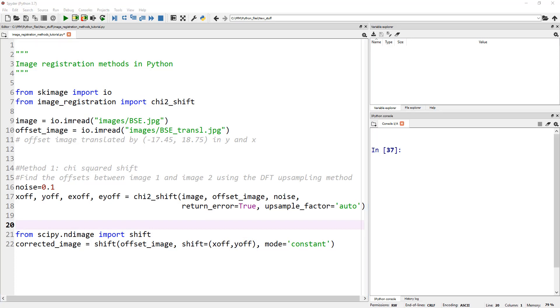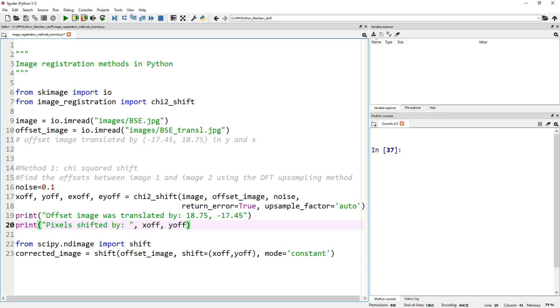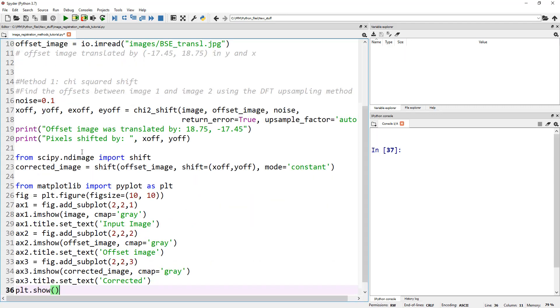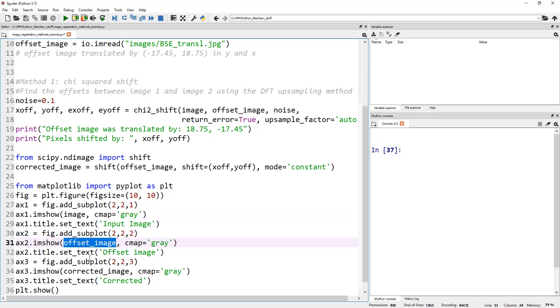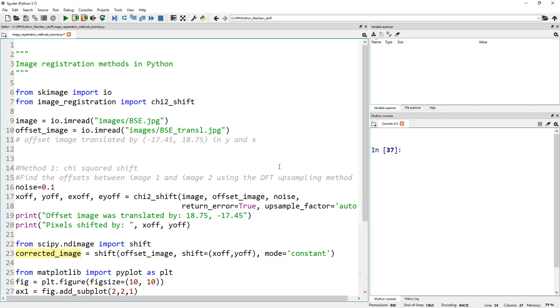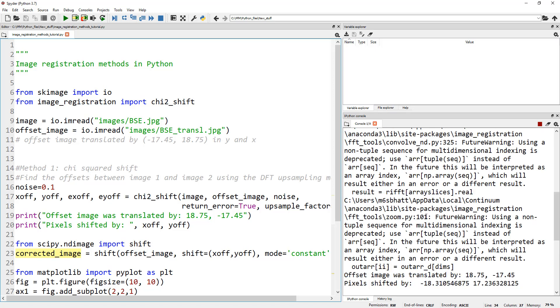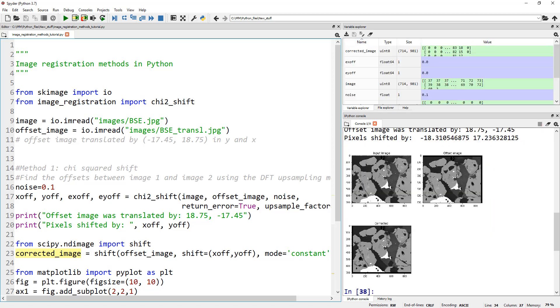For that, we're going to use a function called shift out of scipy.ndimage. Our corrected_image is the shift function applied on the offset_image by x_offset and y_offset. Let's throw a couple of print statements so we can actually see how accurate we got our shifts. Let me also throw a few plot commands here so we can actually visualize it. These lines are basically formatting to visualize our image, offset_image, and corrected_image all at the same time. Let's run this.